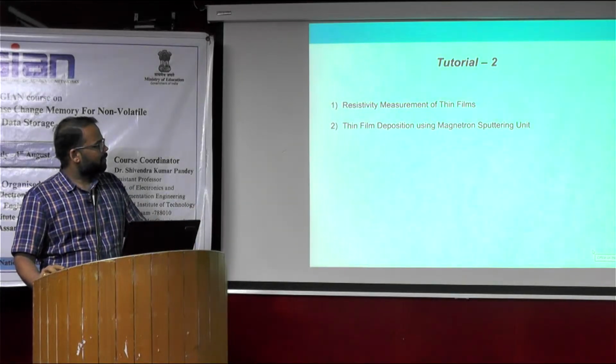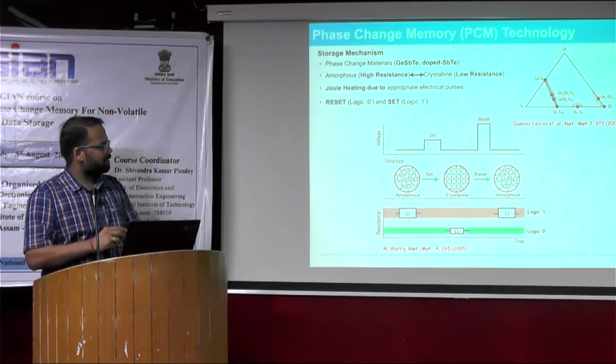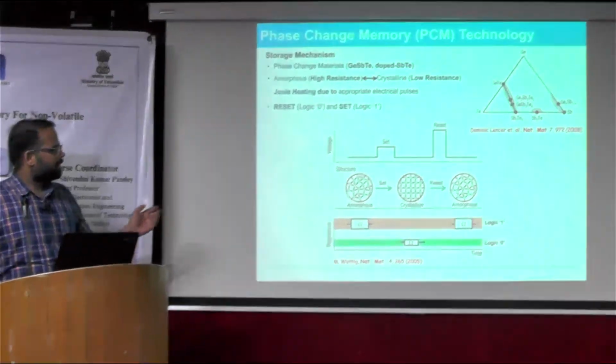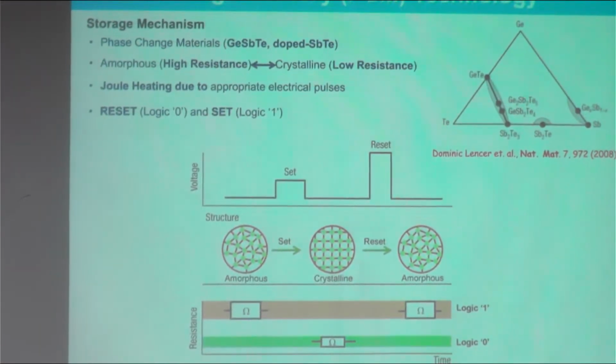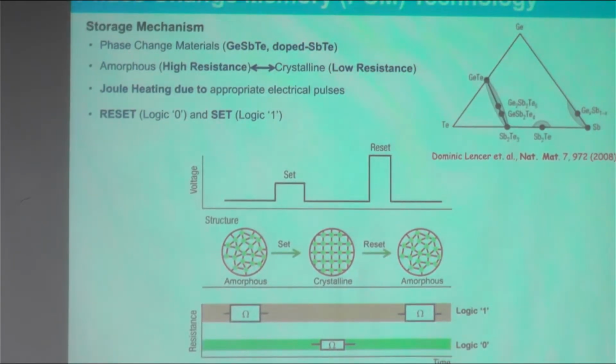If we talk about phase change memory, let us have a quick recap. The thing we have probably witnessed many times: what the phase change materials are, what the principles of these phase change materials are, set, reset, and all those things. Based on that, we need to understand how you can deposit this film.